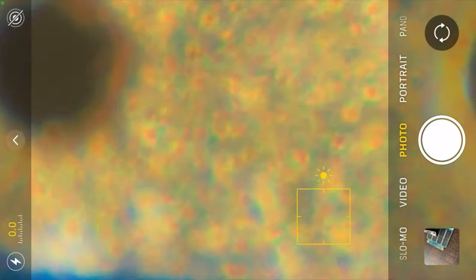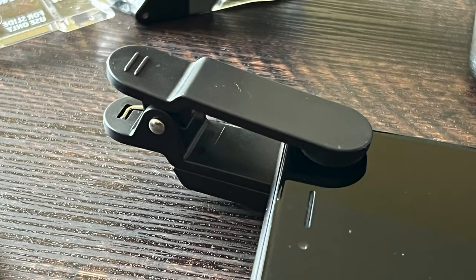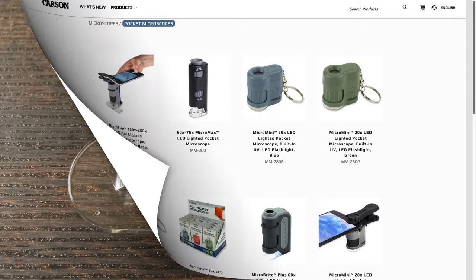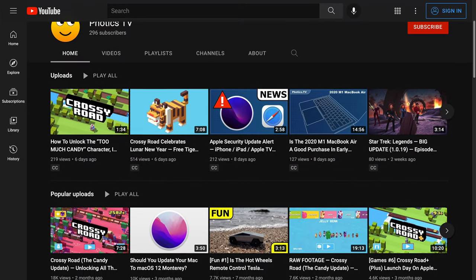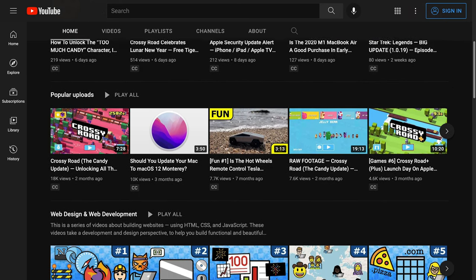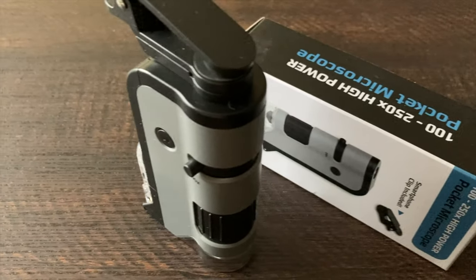It's not bad for $20. I'm disappointed that I don't have a real use for this thing — the zoom is too strong for macro photography, but not strong or sharp enough for professional-level microscopic photography. That sounds obvious though; it's not pro gear. I probably had too high of expectations for this gadget. I suppose there was one very important use: I was able to make this nice video with it. But what do you think? Do you like the Carson MP250 Pocket Microscope? You can let everyone know in the comments.